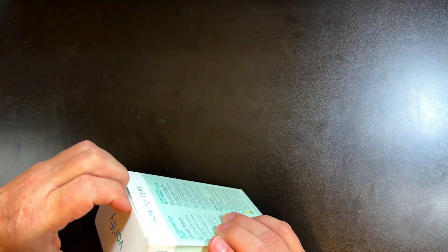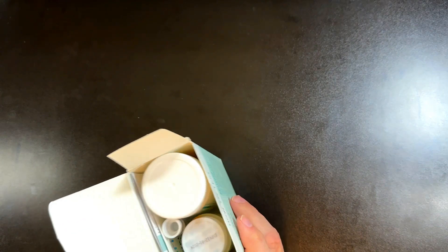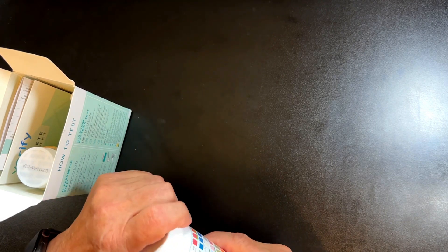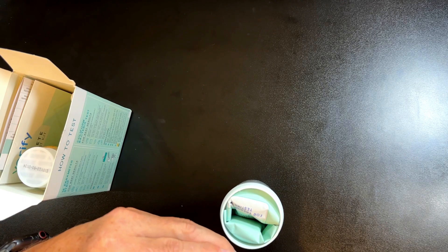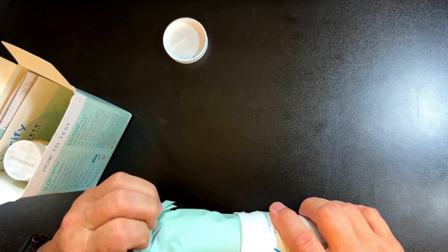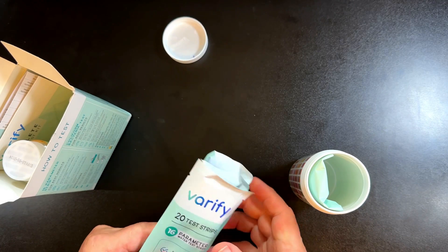It's got 100 test strips. You can do two bacteria tests, but you can do 100 tests for the different minerals in here. It couldn't be easier. It comes sealed — I've already broken the seal loose — and these are your test strips, and they're sealed also. Very well thought out.